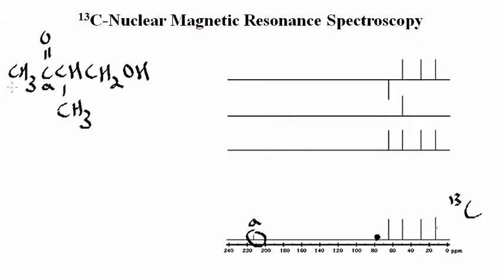We know that this is the carbonyl carbon, A. The sp3 methyl carbons we can label as B and C, and they are going to be those here in the spectrum with the lowest chemical shift. Here, B and C. Refer to the tables from before for the ranges of the chemical shifts that you should expect for these different carbons. And then D and E carbons should correspond here. D and E.